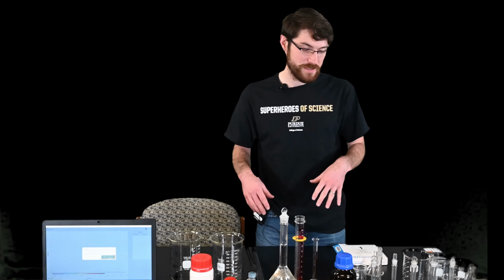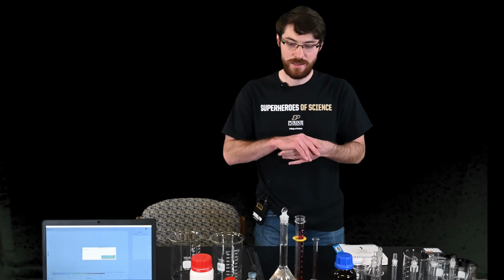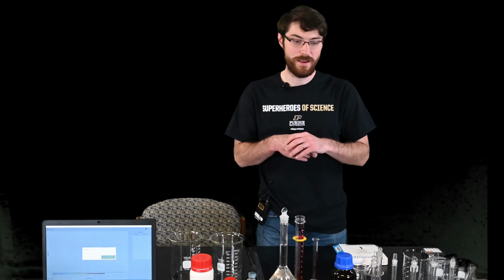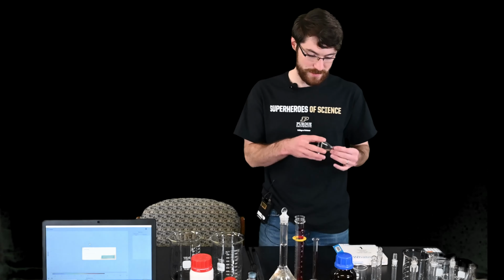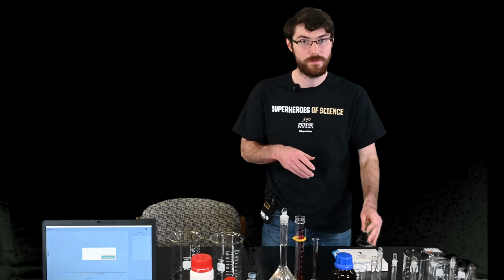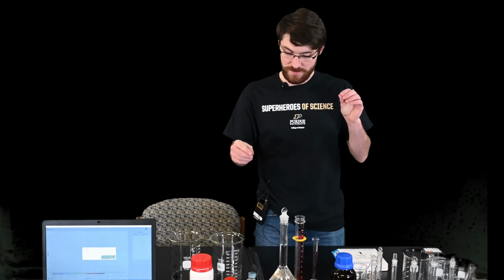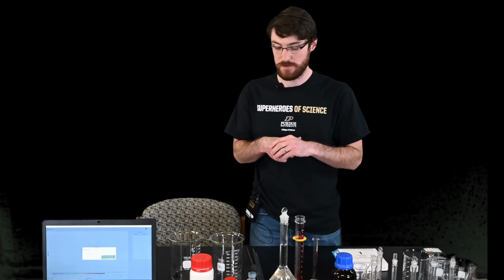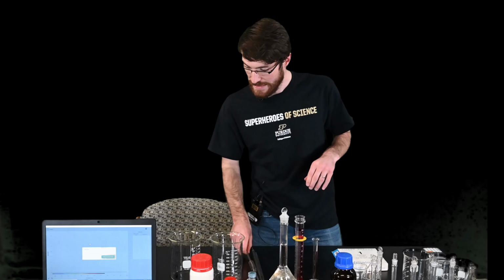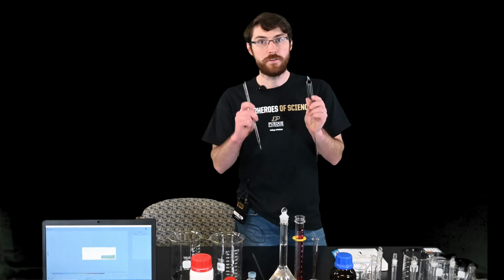We need an assortment of beakers for things like filtration of our sample, waste collection, making up our solutions, and then along with that, we'll need a funnel and then some sort of filter paper. We'll use that to remove any sediments that do come from our sample, which will hopefully be minimal. And that step is not strictly necessary, but it will make data collection a little bit easier for us in the long run. The last major piece of equipment is going to be our volumetric pipettes.